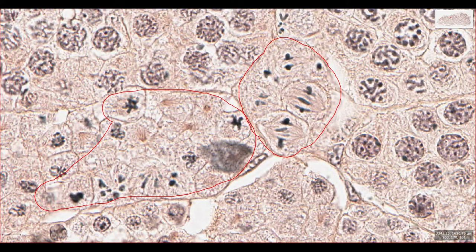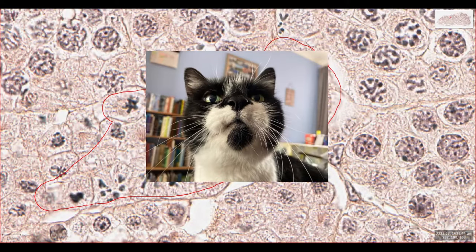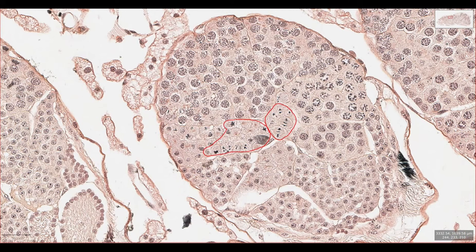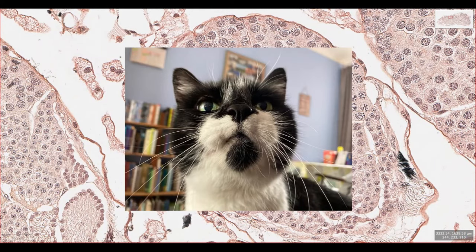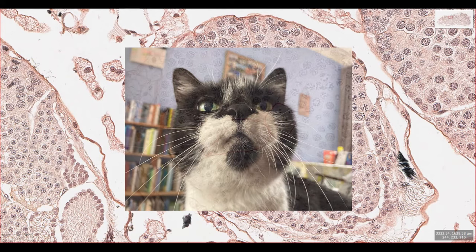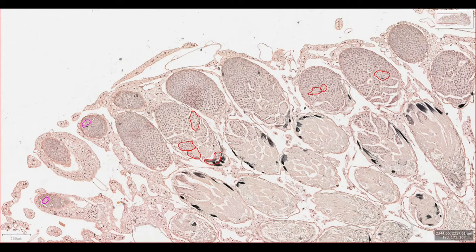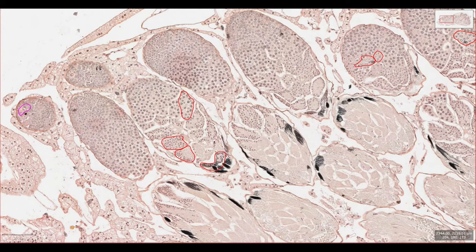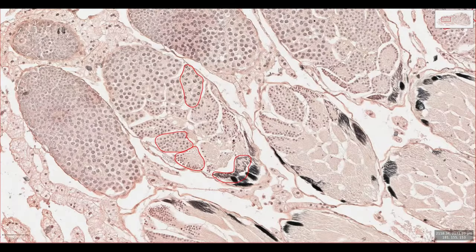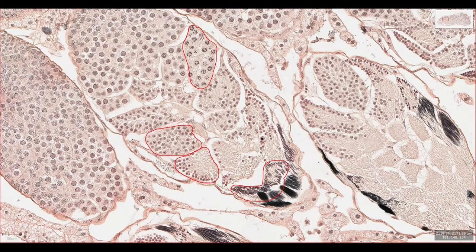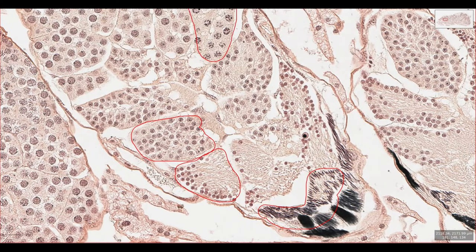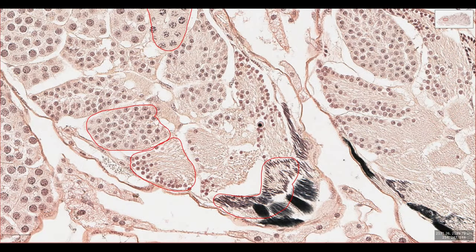Once meiosis is over, each of the resulting daughter cells is now a spermatid. They are immature and not yet ready to go out into the world as spermatozoa. The maturation of spermatids to spermatozoa is called spermiogenesis and occurs in the zone of transformation, which is towards the tip of the testis follicle.